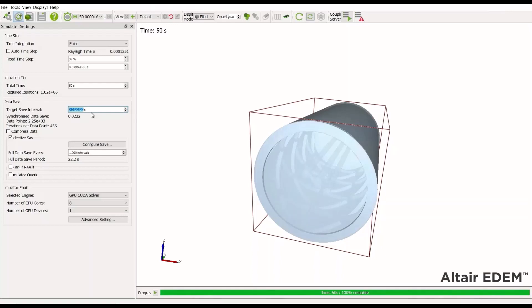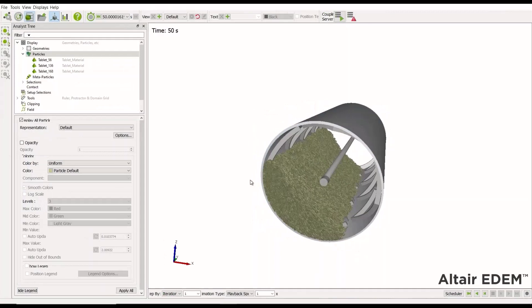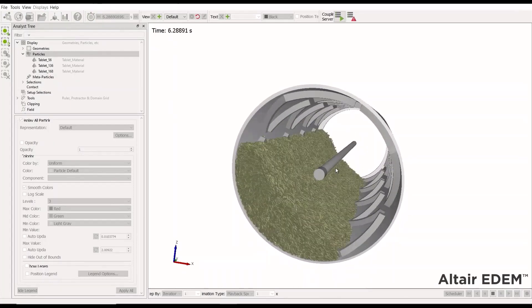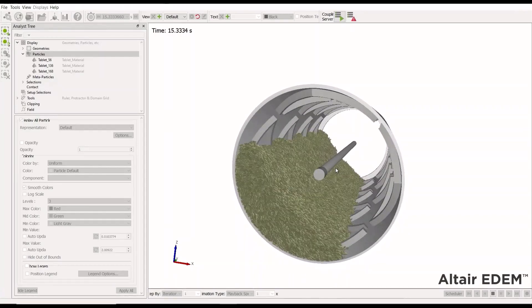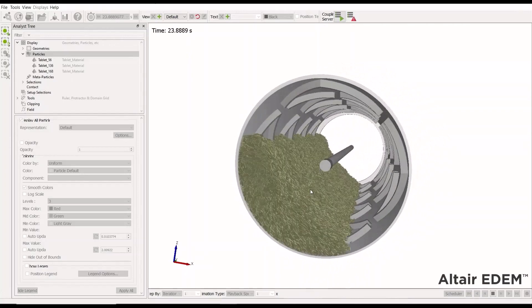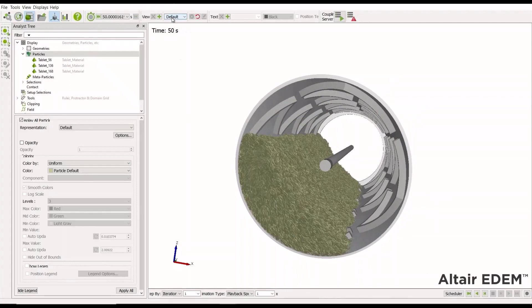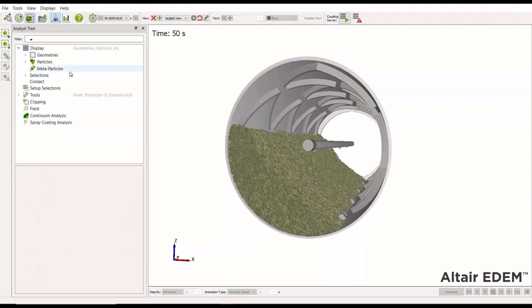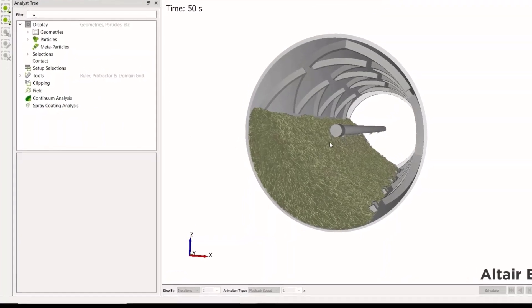If we set up our simulation with the other methods mentioned at the start of the video, we can do the analysis every simulation time step. But for the ray tracing method, the analysis is only applied each target save interval. Going to the analyst, we can play through the video and see the coater in operation. Initially it starts from stationary, rotates, and creates a nice flow profile. We have our spray bar already set up with the CAD. We go to the last time step and select our predefined views to set up the spray coating analysis — this is the ray tracing method so it's purely done in post-processing. First we define a position for our rays, which are going to be cones, and assign them to this spray bar.